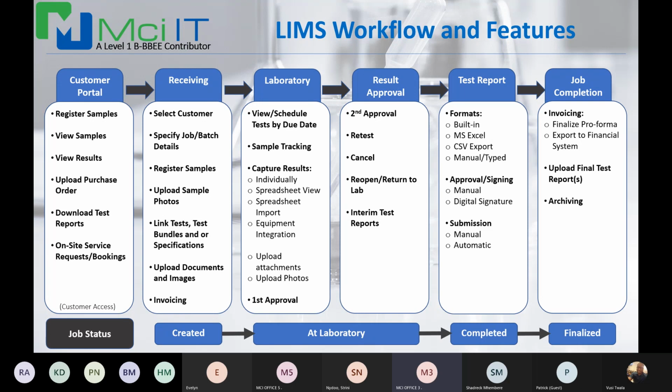So that's what we've gone through now and looked at. It's a high-level laboratory process. Some laboratories are much more complex, but they still go through more or less the same stages in terms of what we saw here. So I think before we cover the flows of the other modules, I'll quickly just jump to the live app so we can just relate this to that particular module in the app.